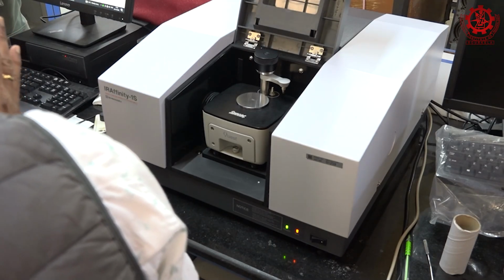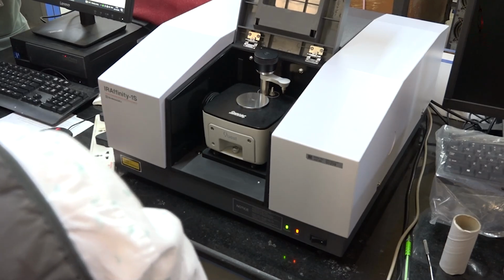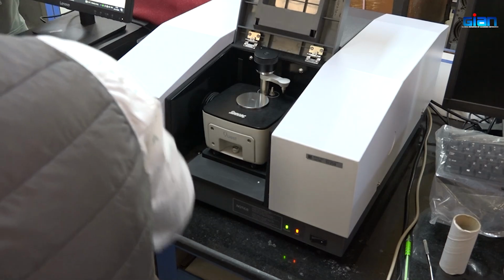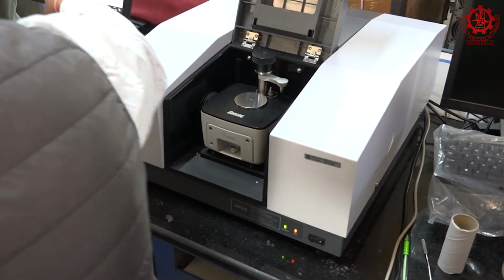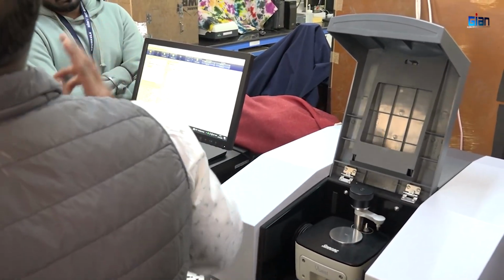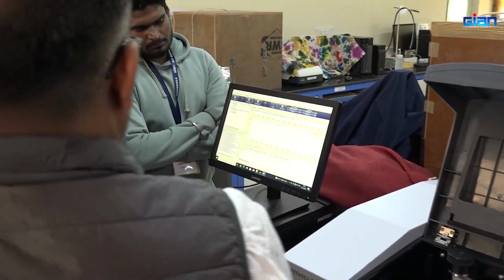We don't want that one. So we let that solvent evaporate. Now after that, we can do another scanning. So you will see once it is scanned, now you got the spectrum. So these are all the peaks from your compound.